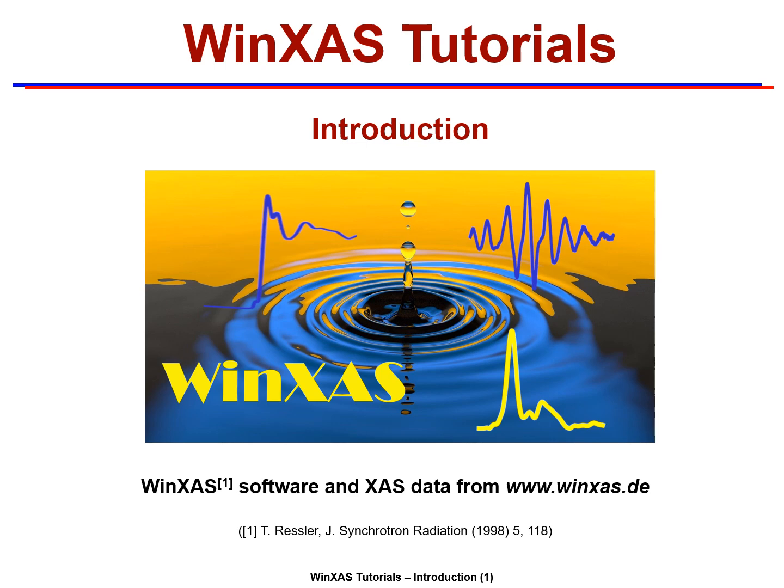The first part will contain a brief introduction to the analysis procedure covered in the tutorial. The second part will contain a hands-on session where I will be using the software to analyze selected experimental XAS spectra. The WinXAS software and the experimental data can be obtained from the WinXAS website.